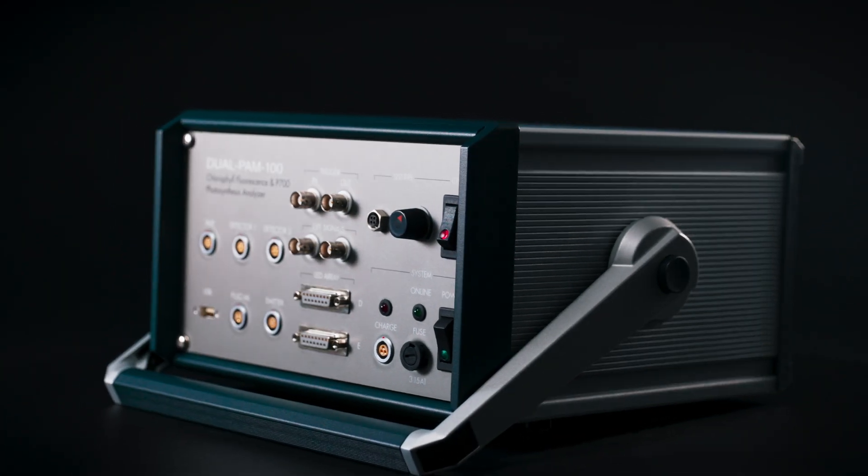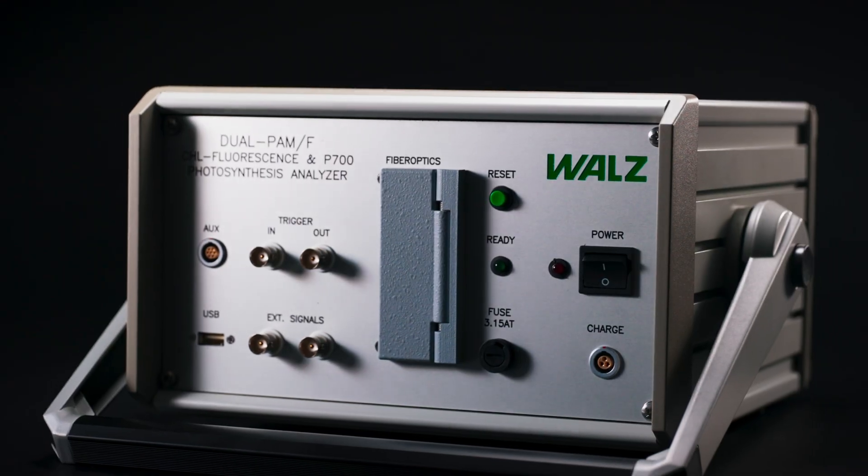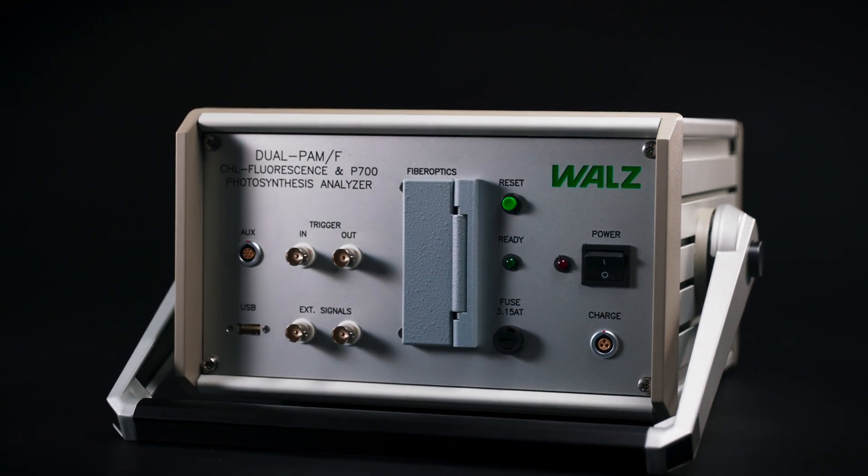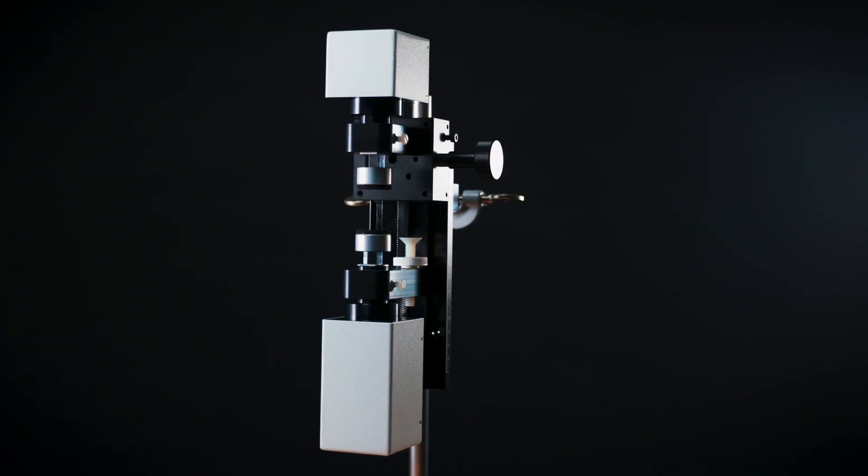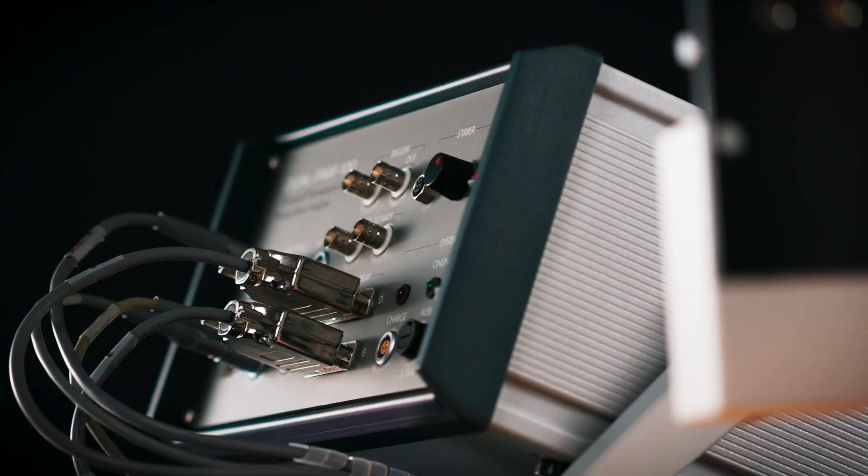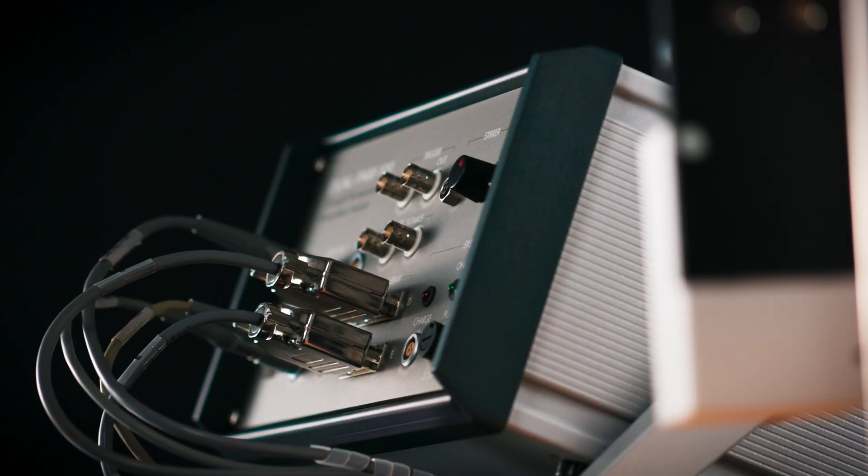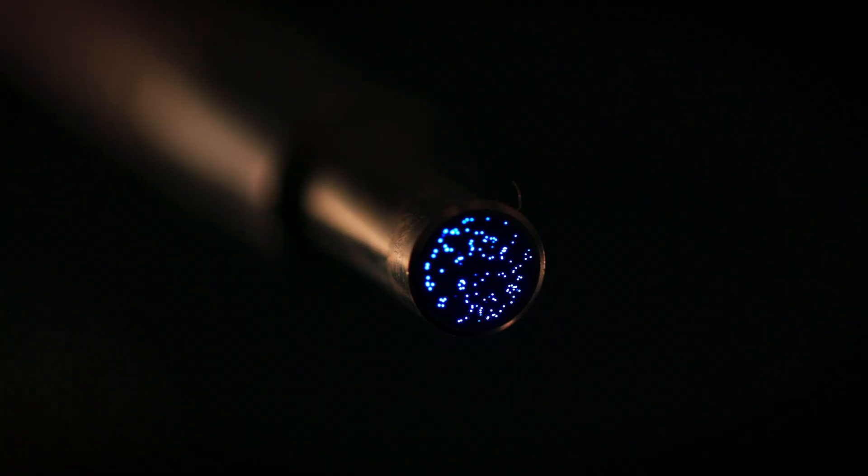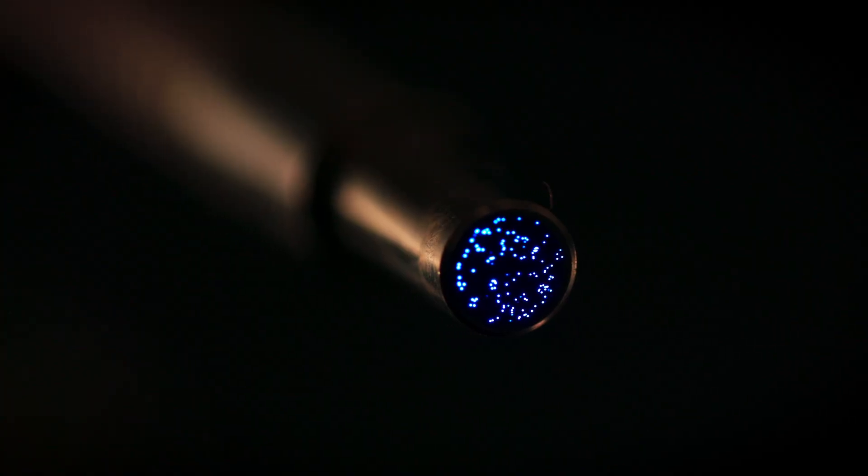In many more applications, Dual PAM systems have proven themselves. Whether you are working with the modular or the fiber version, the Dual PAM systems will give you a deeper understanding of photosynthesis.